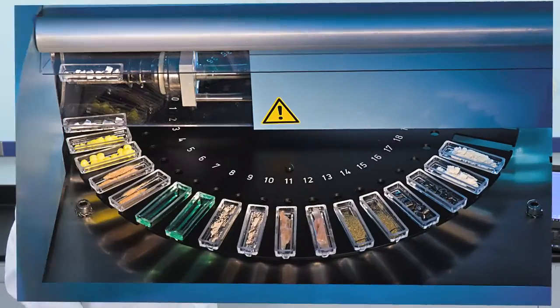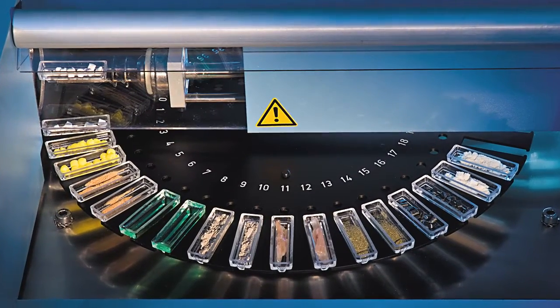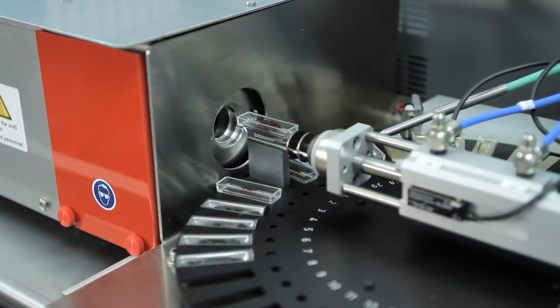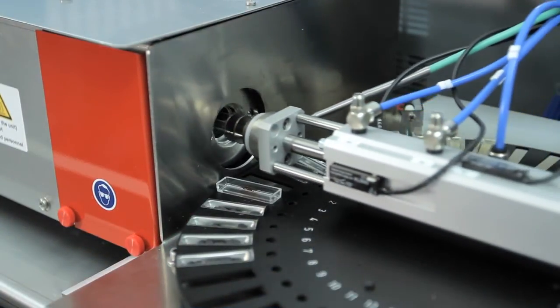Simply load a solid or liquid into the sample boat and place the boat onto the auto sampler. A pneumatic arm will pick up the sample and inject it into a furnace for drying and decomposition.